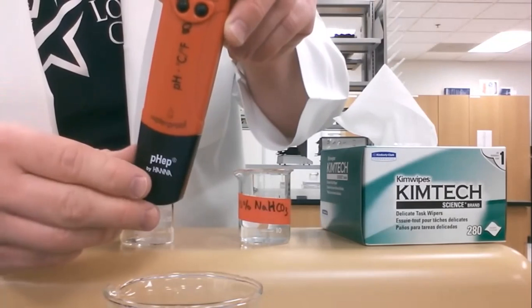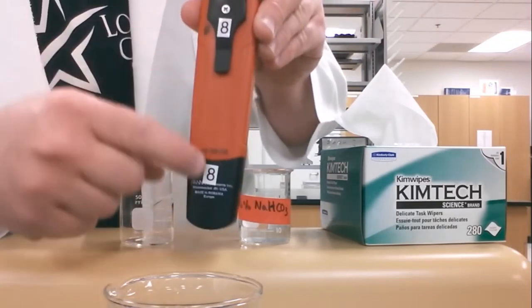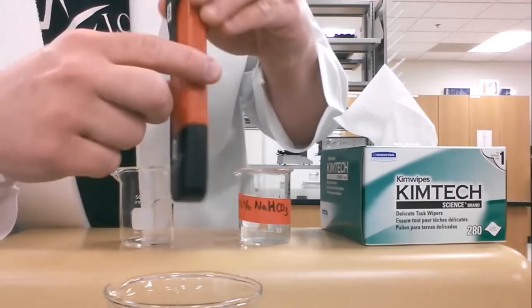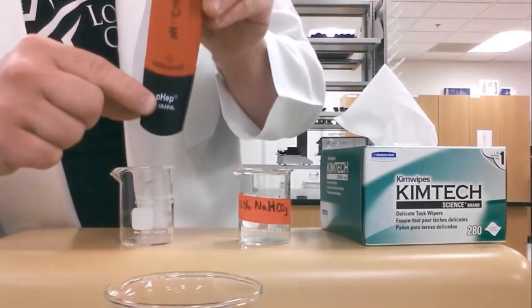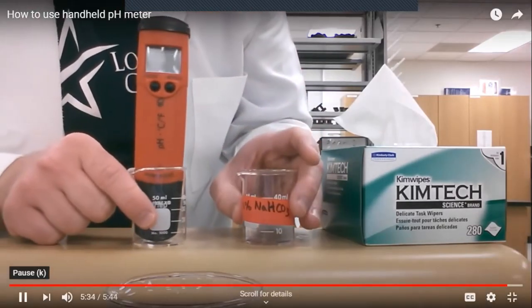You know which way the cap's going to go on by looking at the numbers. So the numbers should both be on the same side. That's how you're going to know which way the cap goes on. Okay, so basically that's how you're going to use this instrument.